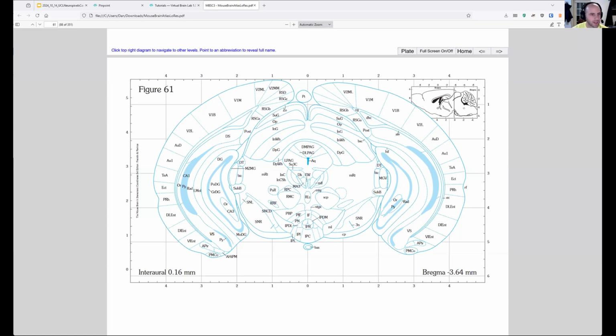Does Pinpoint take into account large blood vessels, sinuses? No, we have no information about that. It changes from animal to animal. I wouldn't trust a planning software or an atlas to really know exactly where those are. You have to be paying attention during your experiments.